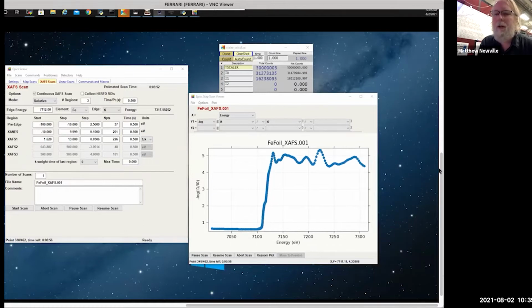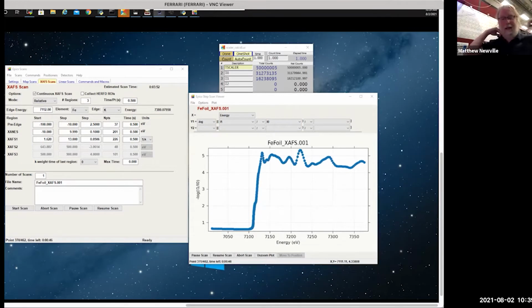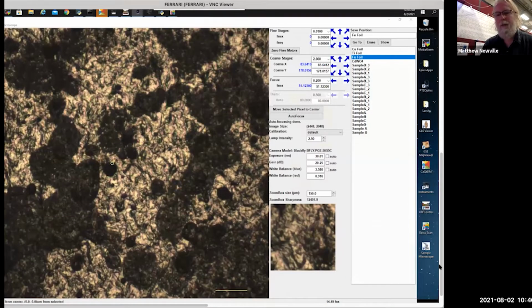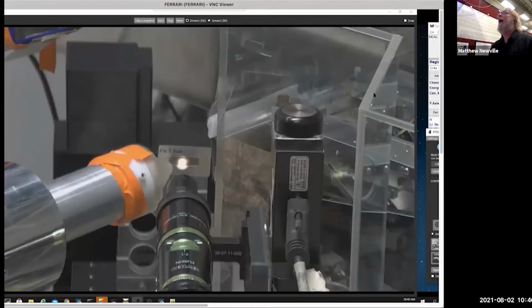Okay, so there's a question from Jim Han: are I0 and I2 identical in size? That's a good question. So at this beamline, no. And in general, no, though it's good to do that. For I0, our beamline I0 chamber is 200 millimeters long, and it's always filled with helium. I go back to this view and zoom all the way out.